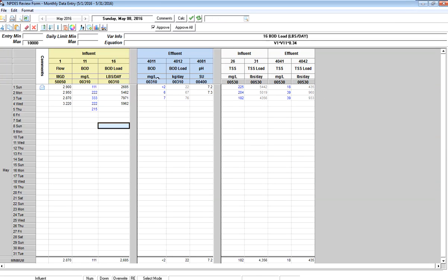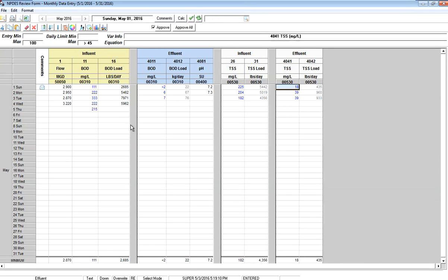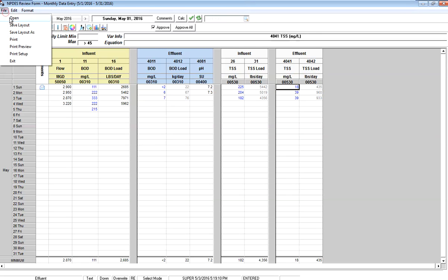Once I've made all of these changes, maybe adding another divider bar to make that look a little bit better, changed all my column widths, and got the form the way I want it looking, I can go to File and Save Layout. That will save over the existing NPDES review form, or I can go to Save Layout As. I'm going to go to Save Layout.